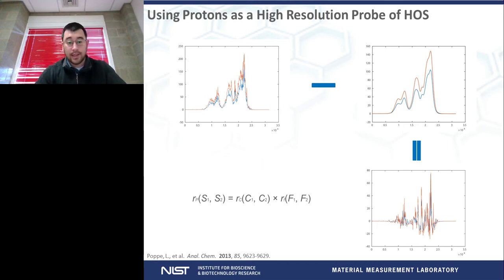What we then do with this data in the profile method is we apply a Gaussian line broadening function to produce this contour spectrum that you see. We then do some subtraction of the contour spectrum from the original spectrum, and we're able to produce this fingerprint. What we can do from there is take it a step further, and we can take this fingerprint spectra and compare it to the fingerprint spectra of other protein therapeutics or protein therapeutics from the same lot. So we can get an idea of similarity or dissimilarity.